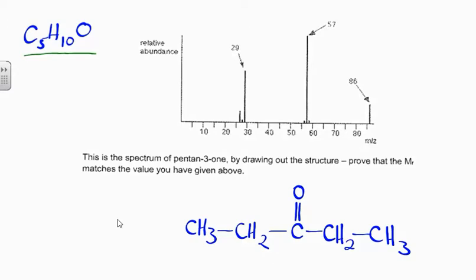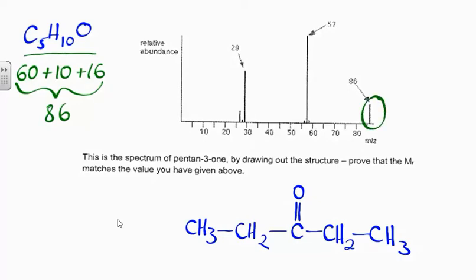C5H10O. The first thing that I would look at on a mass spectrum of an organic compound is just matching up the peak furthest to the right with the Mr of the compound, which in this case is 86. So I'm fairly happy that there we go, we've got a peak at 86, so this is matching the Mr. This is known as the molecular ion peak, which we'd abbreviate as M+. So this is the whole of the molecule which has gone through as an ion being detected.